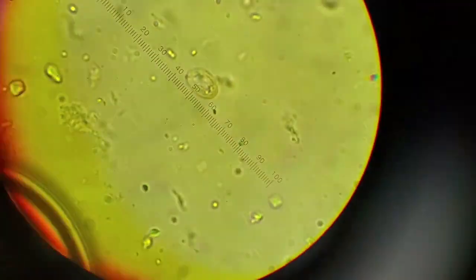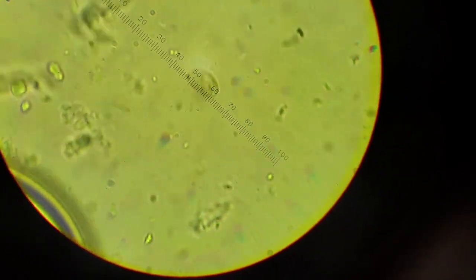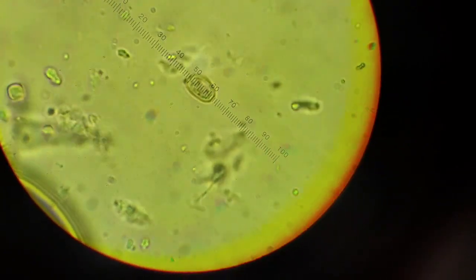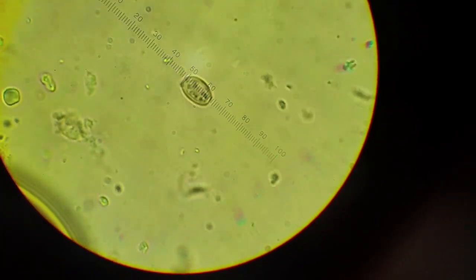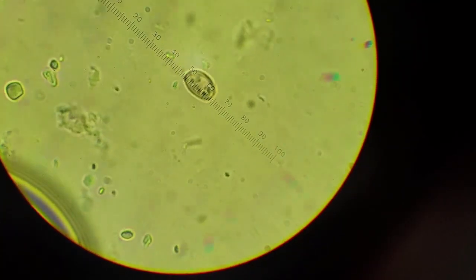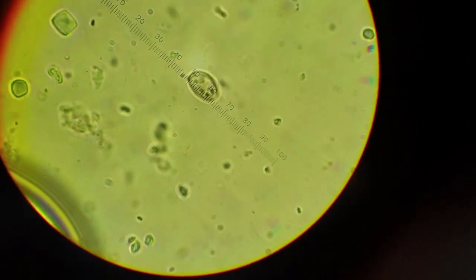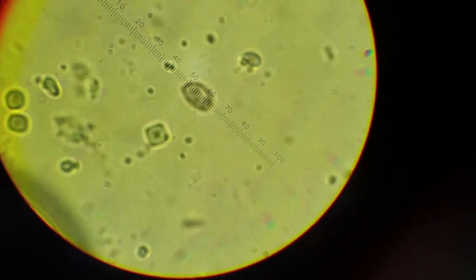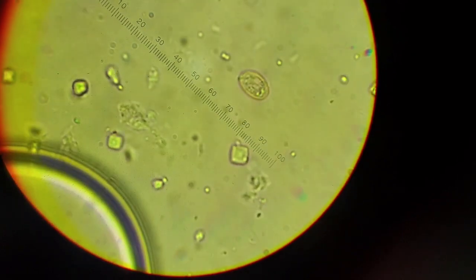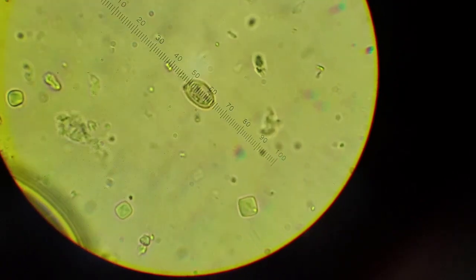Nope. This is going to make everyone dizzy, but I don't have an option. And then you would obviously move it so that it's lying over the micrometer. And you would measure the base, not including the apiculus. I usually move the spore until it's up against one of the longer lines, the starting point. It always makes it so much easier.